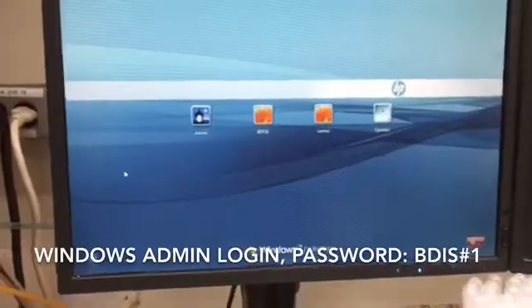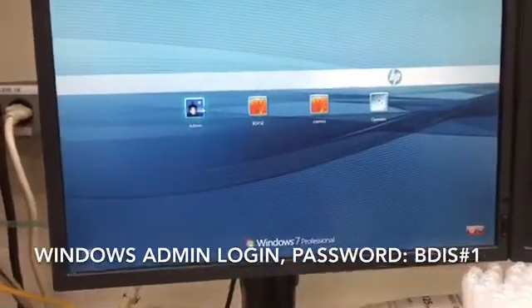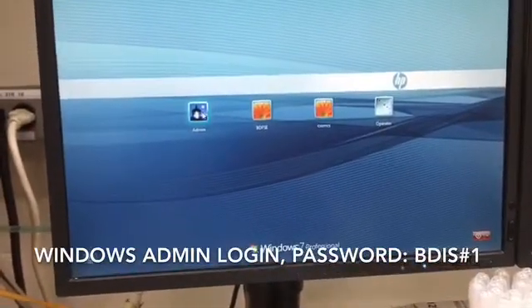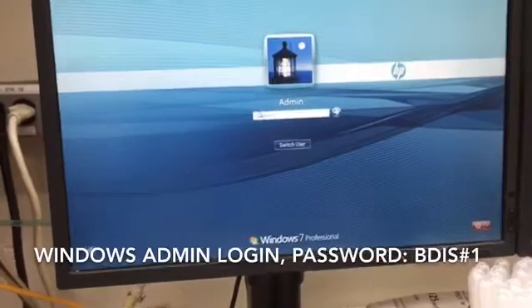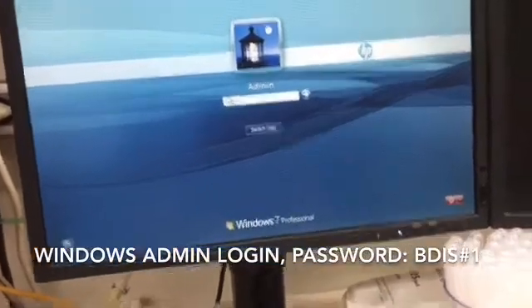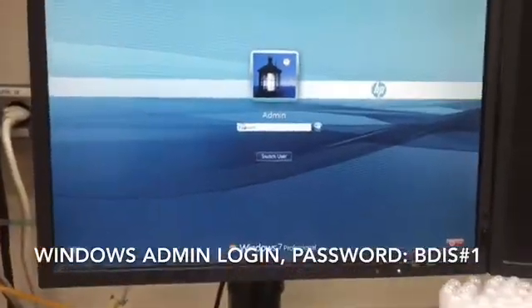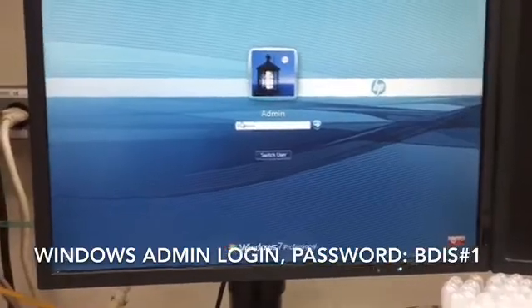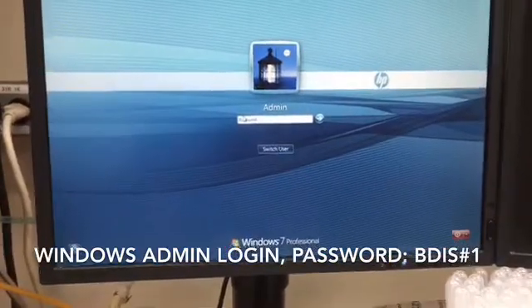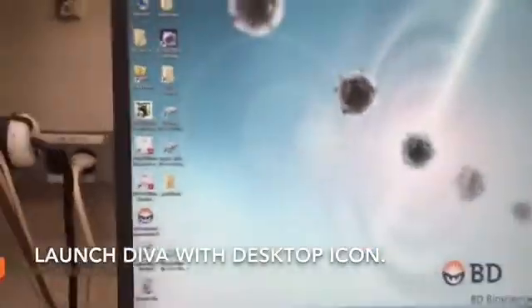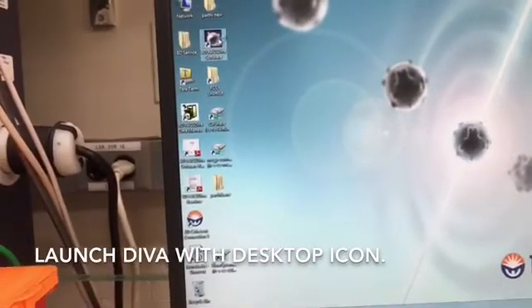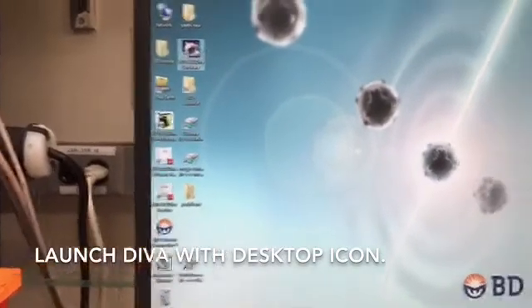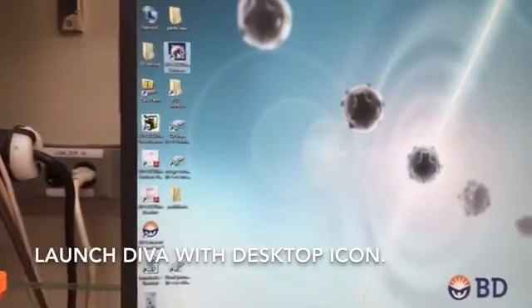Once the computer boots up, we all log in using the Windows admin login. We all use the same common password, which is all capitals: BDIS, pound sign, one. Once Windows comes up, you'll see there's a desktop icon to launch FacsDiva, so I'll double-click on that.